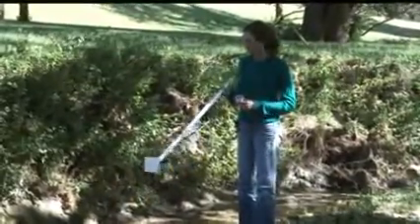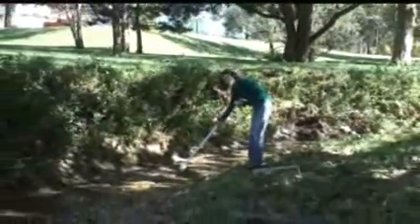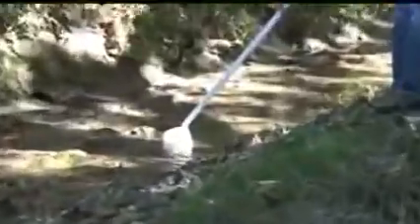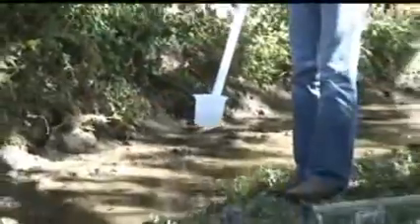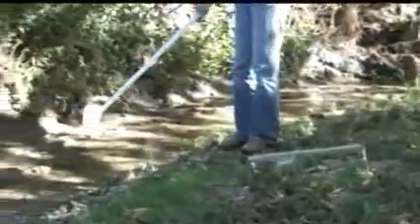In order to use the scoop, reach into the stream, being careful not to disturb the bottom layer of sediment, and scoop water. Fill the cup about half full, swish it around, and dump it out on the stream bank — not back in the stream.